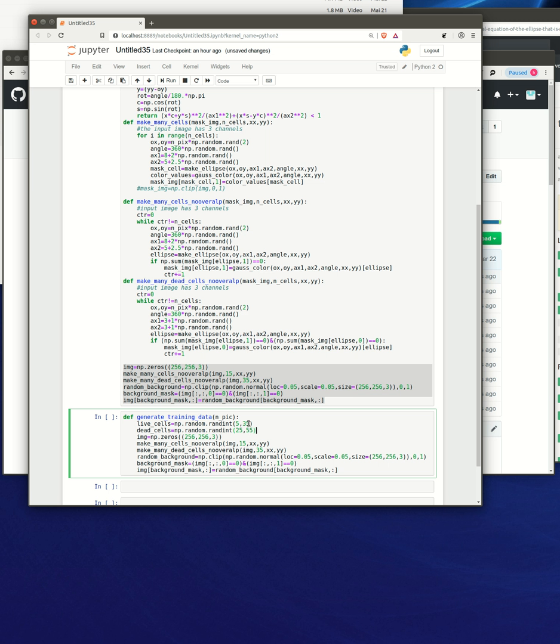For a study of how the amount of cells that are put in the image influence the end result, you can refer to our supporting info. The main message is that it is not too sensitive, and you can make a mistake of the order of 50%, underestimating or overestimating in both directions. So this would be then the amount of live cells, the amount of dead cells.